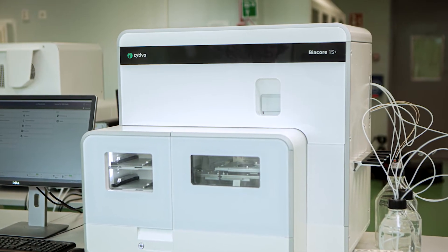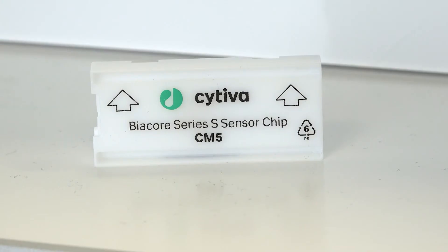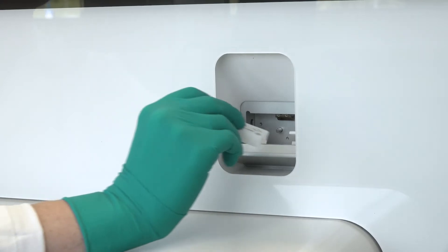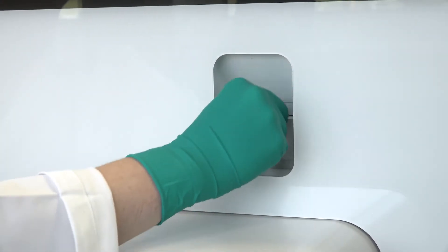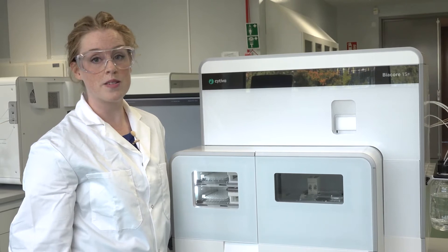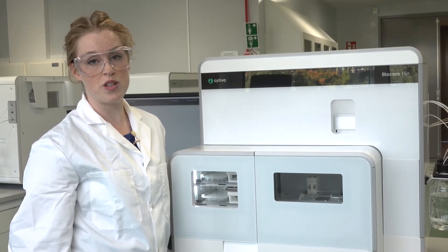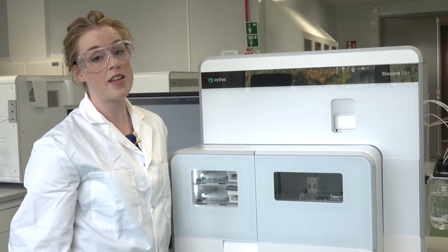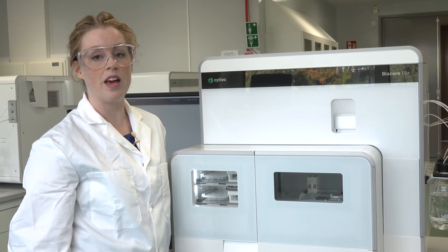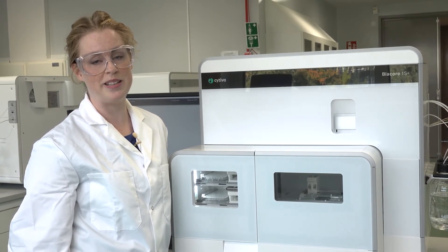This is Biacore 1S+, one of the three systems in the Biacore 1 series. They all use Series S sensor chips and the systems have six flow cells. The flow cells can be addressed individually or in pairs, and for two of the systems you can also address four or six flow cells in sequence, which increases flexibility when you develop and set up your assay. It also reduces sample volumes because you get more data from one sample injection.